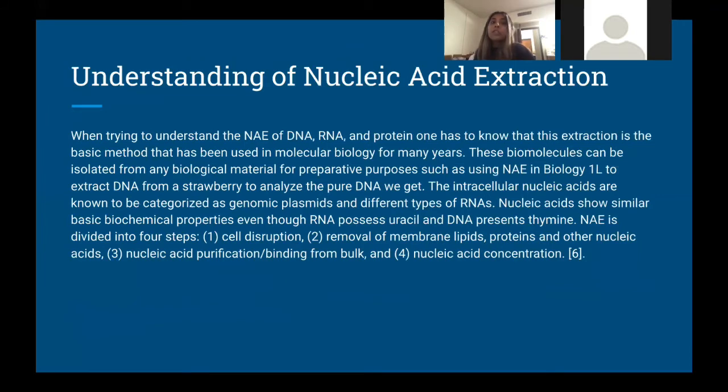And then understanding of nucleic acid extraction. When trying to understand the nucleic acid extraction of DNA, RNA, and protein, one has to know that this extraction is the basic method that has been used in molecular biology for many years. These molecules can be isolated from any biological material for preparative purposes, such as using nucleic acid extraction in Biology 1 lab to extract DNA from strawberry to analyze the pure DNA we get.